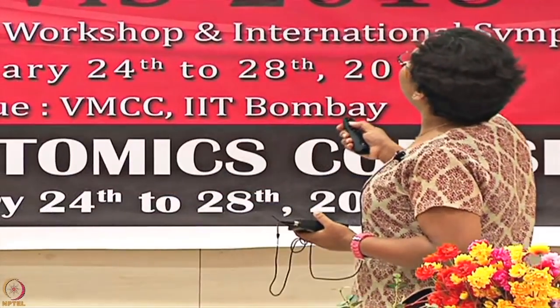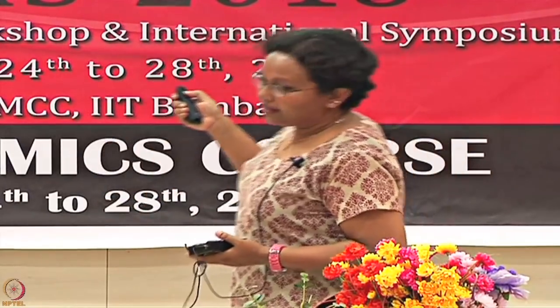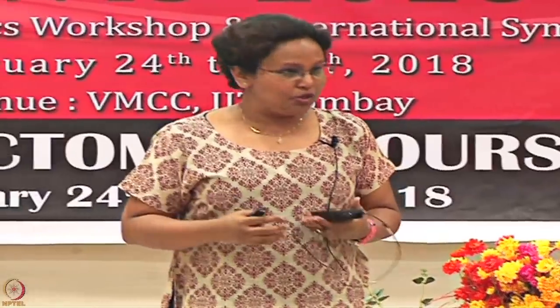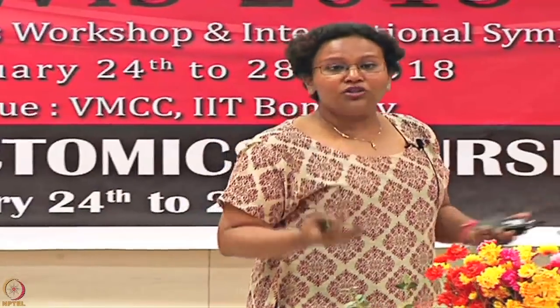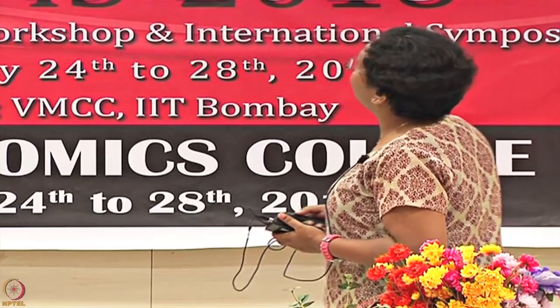If you see out here at pH 5.5, which is actually the highest pH here, you attain quite a large amount of RUs, going to around, I can't even see, 10,000 RUs, which is an extremely huge amount. You don't need that much protein. If you are reaching around 4,000 or 3,000, it's more than enough for any of the applications that we are talking about.